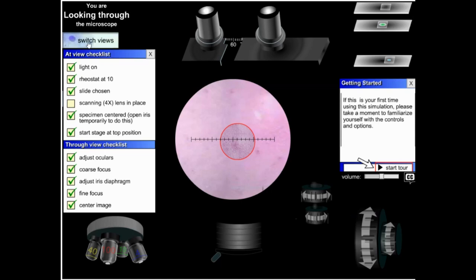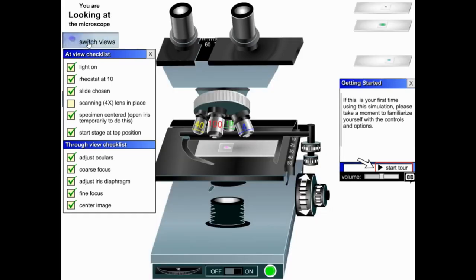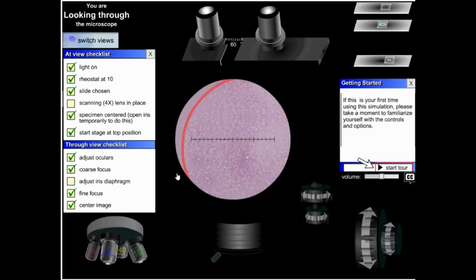And this is a capsule stain, so it's not a stain that we've done, which means it's actually a negative stain. So it shows your bacteria are clear against a dark background. So see, the bacteria are the little light colored dots, actually.